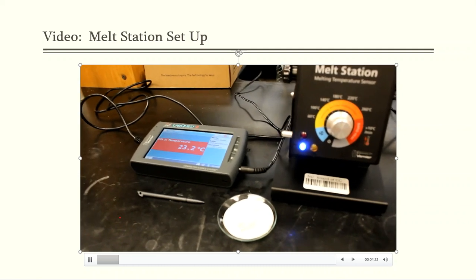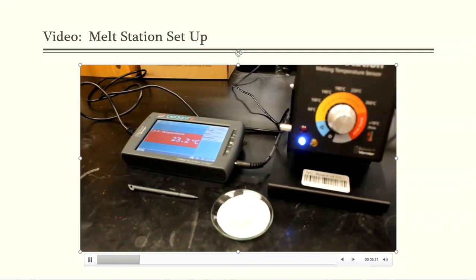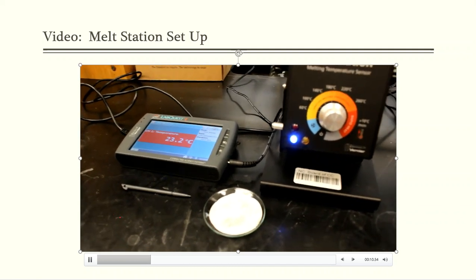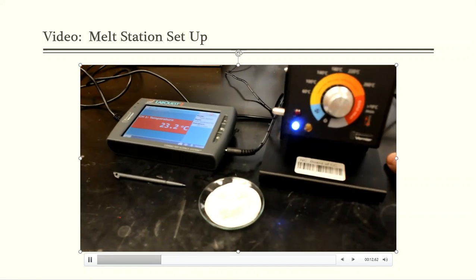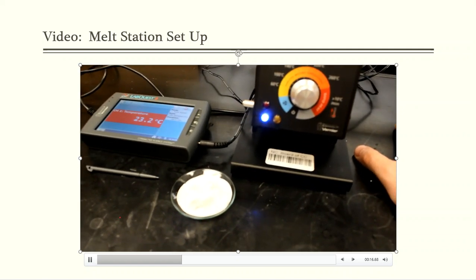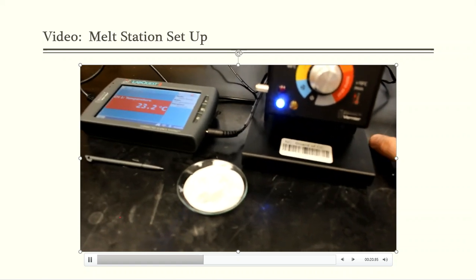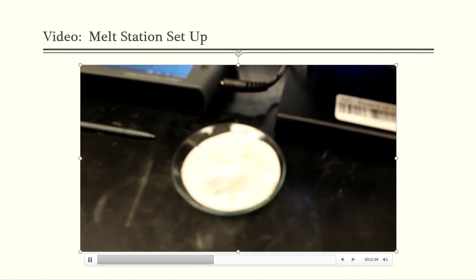All right, guys, so my product has now dried in the oven. It's been in there for about 15, 20 minutes. The temperature got over 100 degrees, and that's important because that's the temperature at which water will evaporate. If I put it in the oven and it was below water's evaporation or boiling point, then it would never dry. The water would continue to cling onto the crystals and so forth.